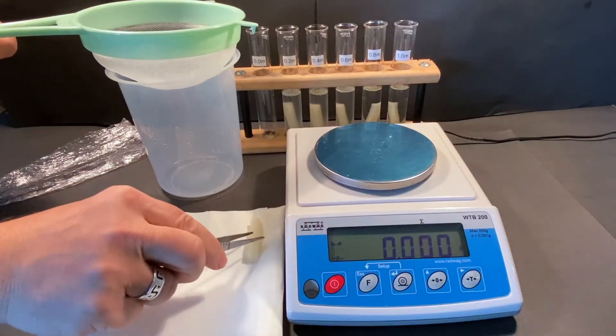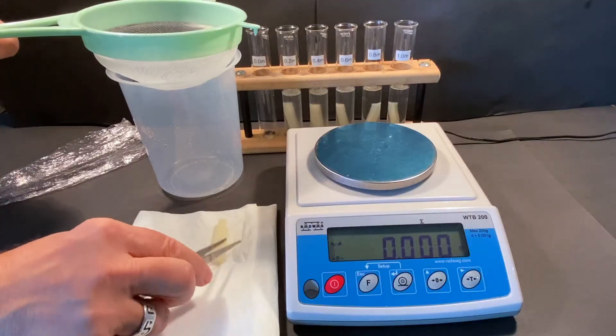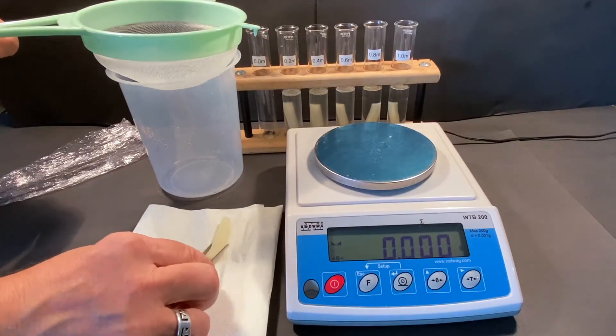Draining the sucrose solution from the samples is done using a sieve. This can be done into a beaker provided or into one of the laboratory sinks.